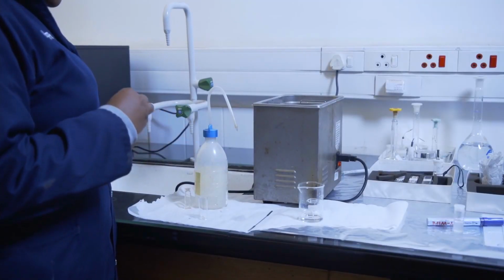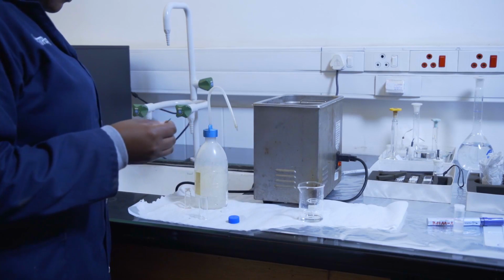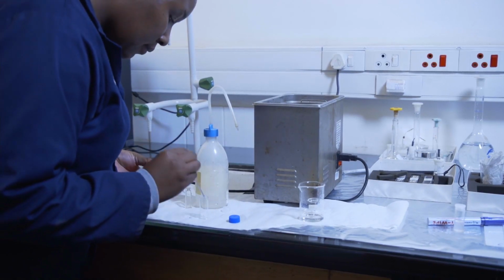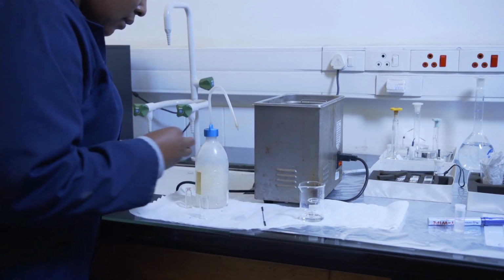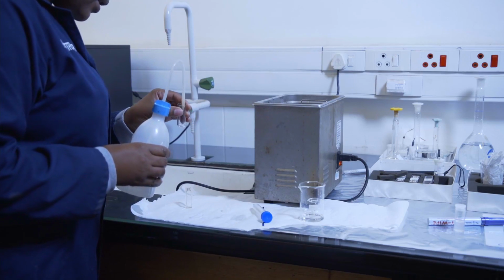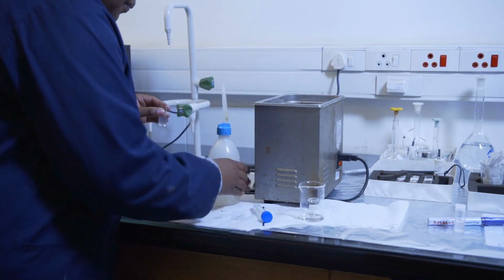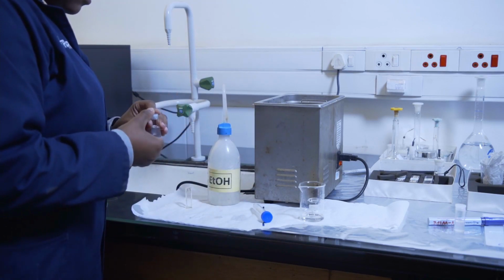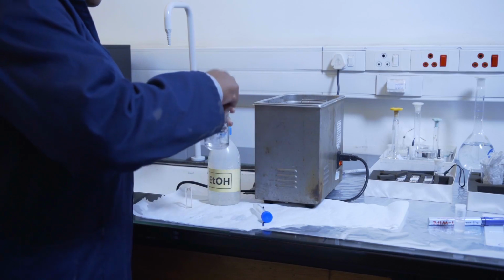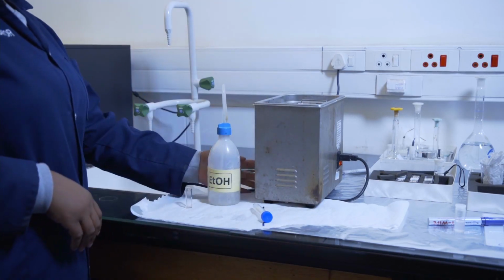To prepare our sample for PL analysis, we'll then take a spatula chip of our zinc oxide, place it in the vial, and then add some absolute ethanol. And then place our vial in a beaker with some water. Place it in the sonicator and sonicate for 10 minutes.